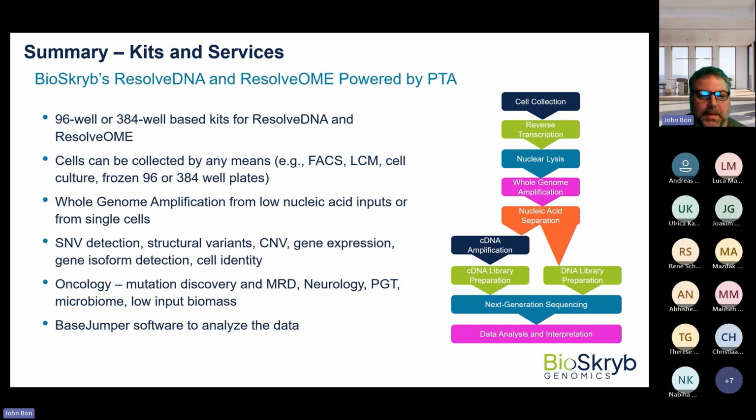There's many different applications, including oncology-based, so mutation discovery, or MRD that I just talked about from that ASH abstract. If someone already has cancer and there's a longitudinal study being done, you can look to see if the cancer comes back, or you can learn more about their cancer if someone relapsed by isolating those circulating tumor cells and looking at the DNA and the full-length transcriptome.